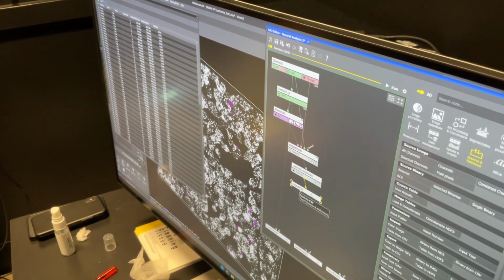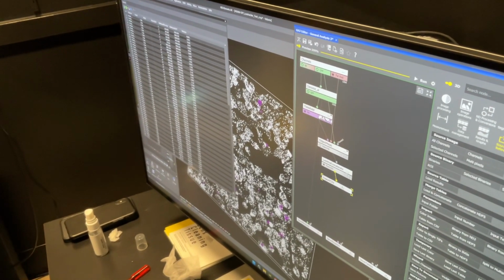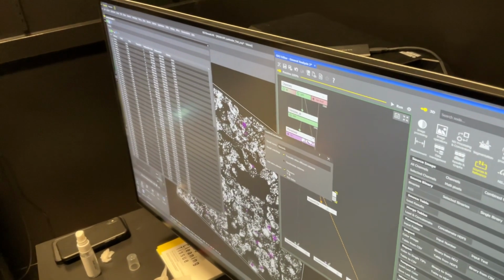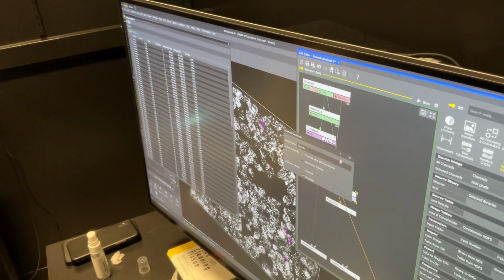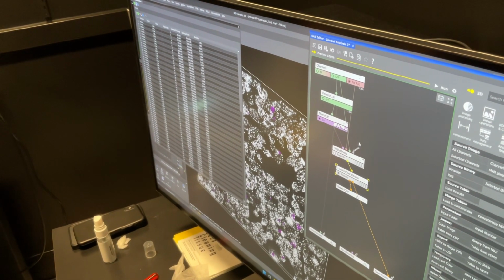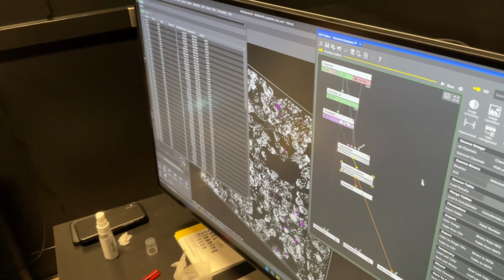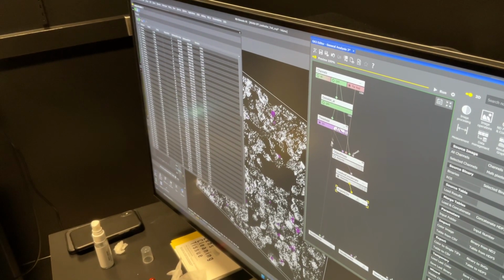That'd be nice. So load and concatenate is what you need to do. I have just been manually compiling them. And then you can tell it what the result name is. File name is useful though, because it'll tell you which image it worked on. We ran this on this image, just to see how we would do this.